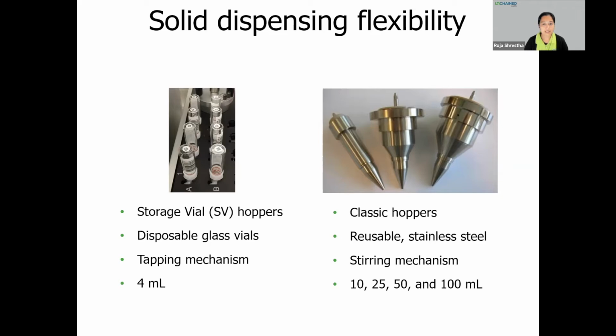The dispensing mechanisms also have learning algorithm built into them. So depending on the properties of your solids, the dispense head can determine how fast tapping or stirring should take place and how far the valves need to be opened. This is continuously monitored during dispense to ensure that the target mass is dispensed within specified tolerance.